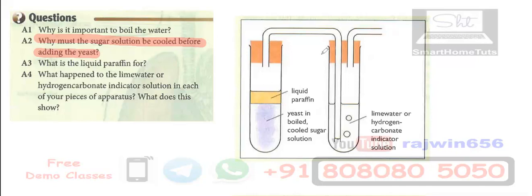Why should we use it cool? It should be cool because when the yeast reacts, if it's hot, it won't react well. No, it won't react. We don't say exactly that.